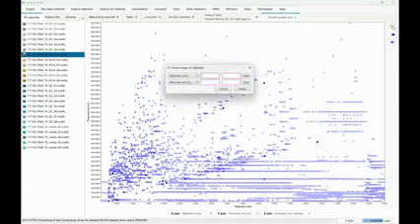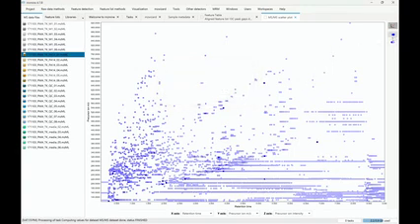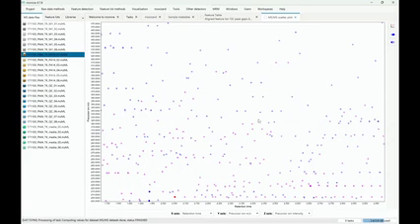And then there's this little button here where you can basically search for some neutral losses, but it's really just one neutral loss. So I don't know what kind of neutral loss I would be searching for, so I will just type in something wider and apply it. And I have to resort the data points basically. And now there's basically all the MS2 spectra that have this neutral loss, but so far we cannot apply it to the feature table. But that's definitely something that we're working on, to find a very easy way of doing this, yeah.